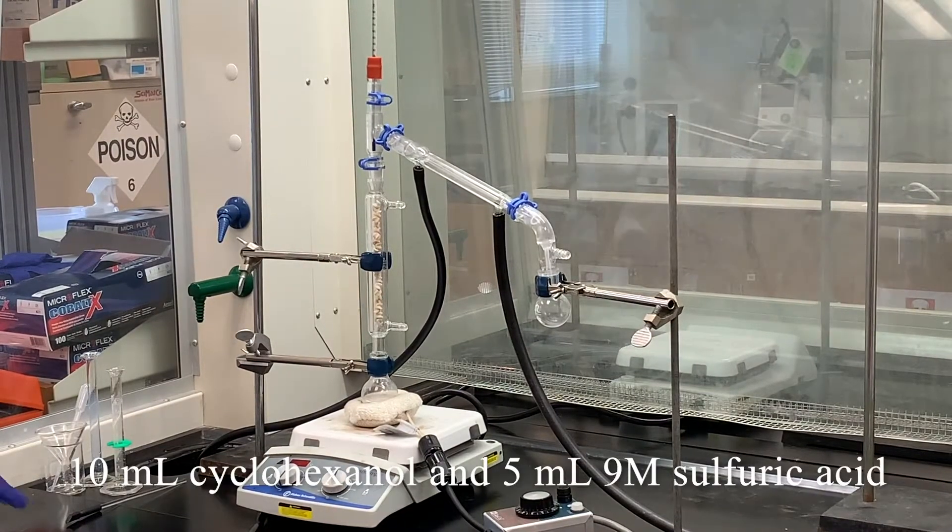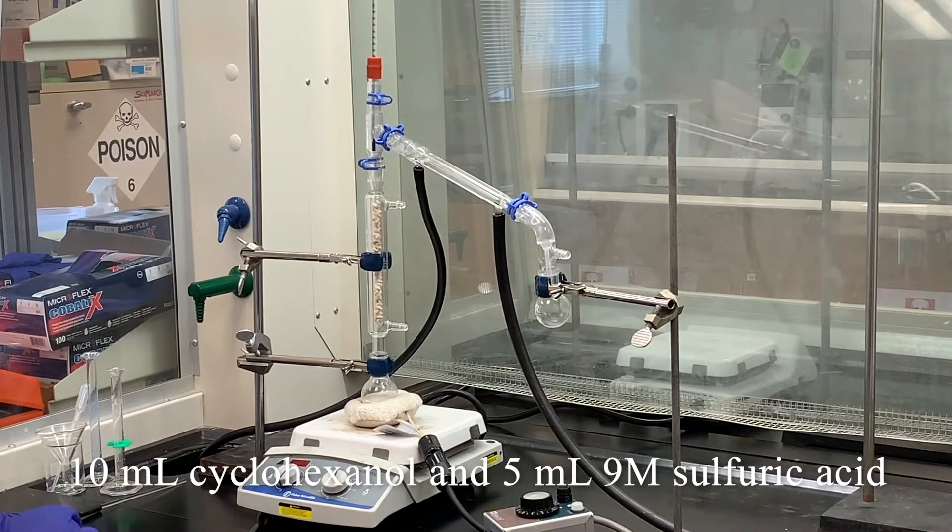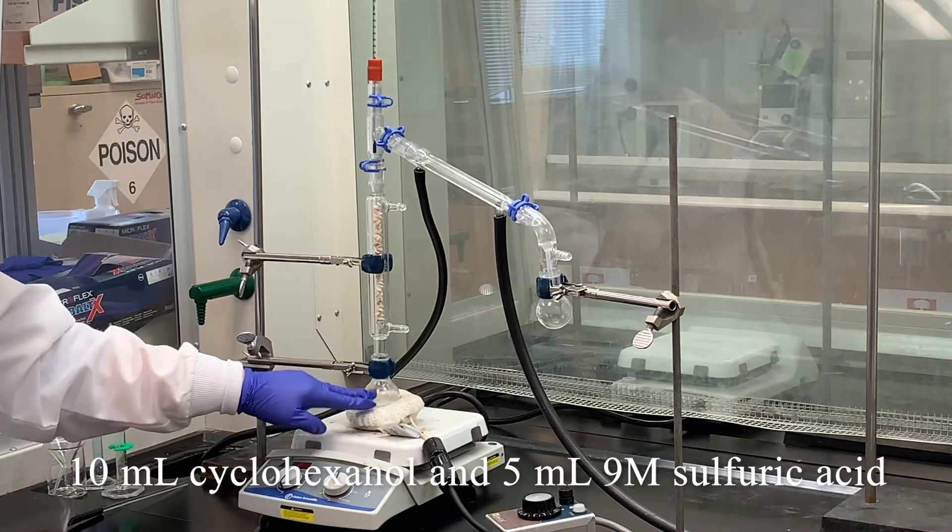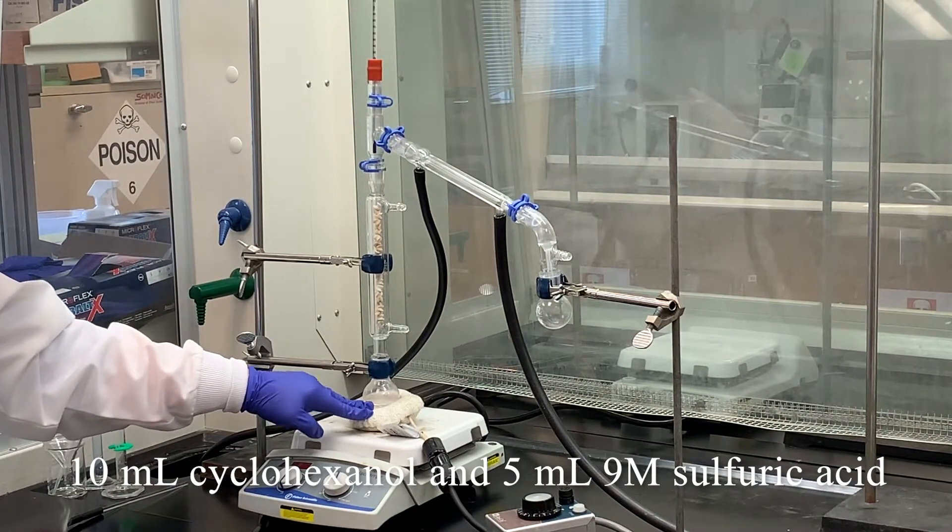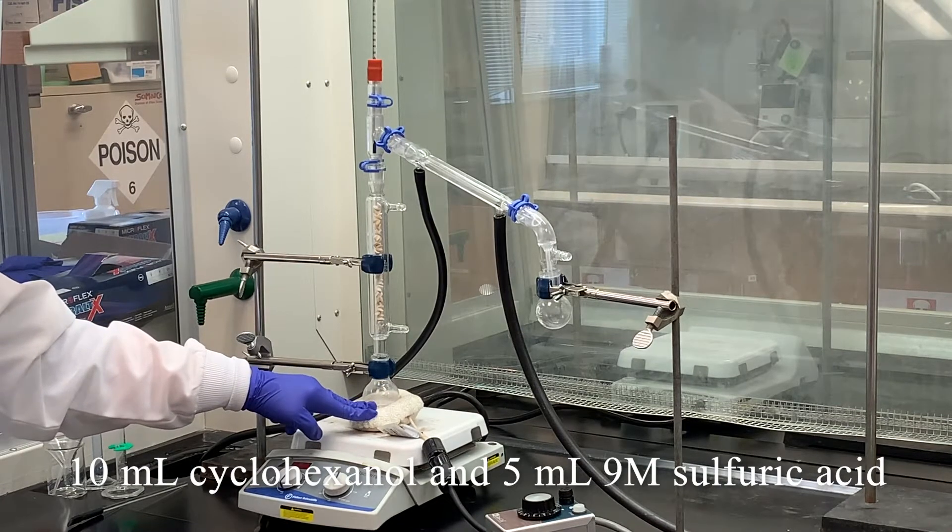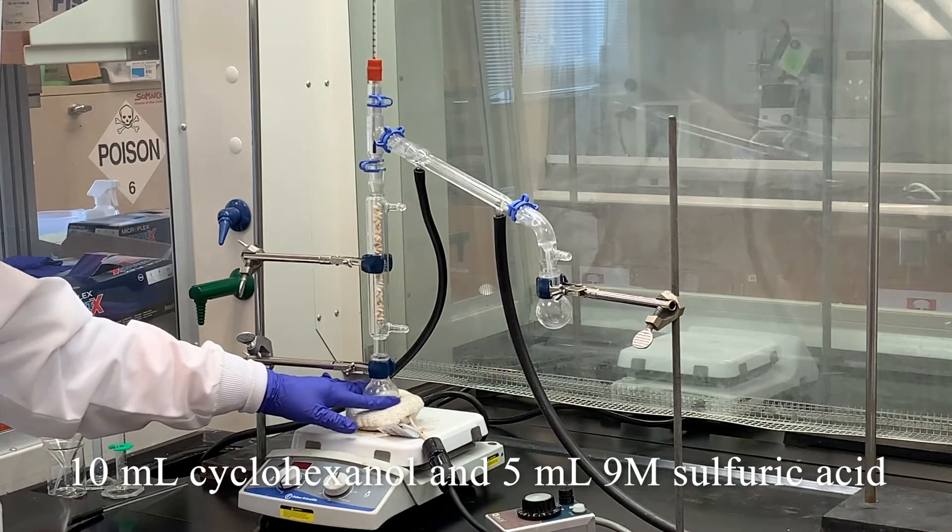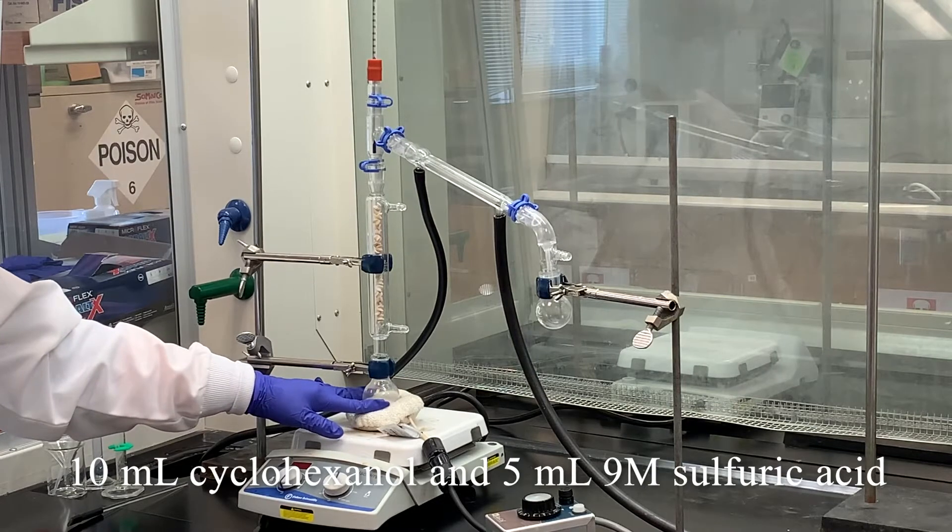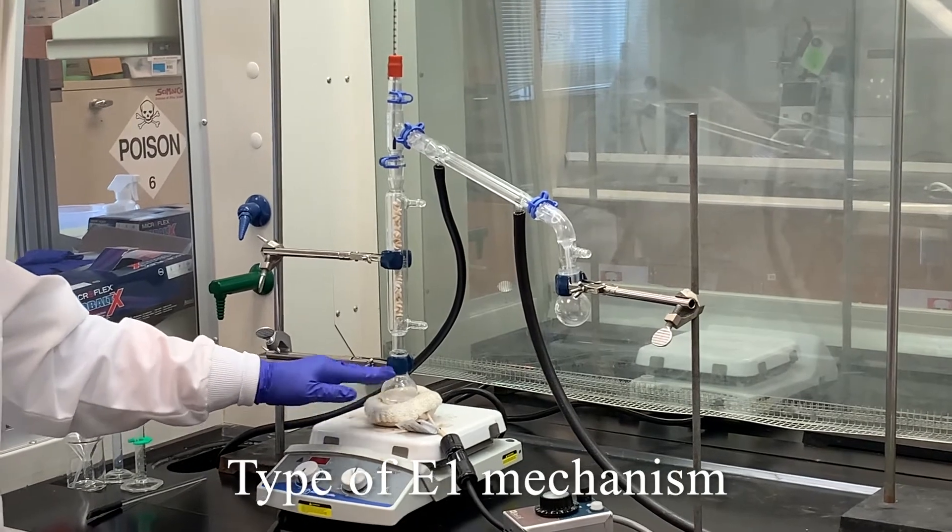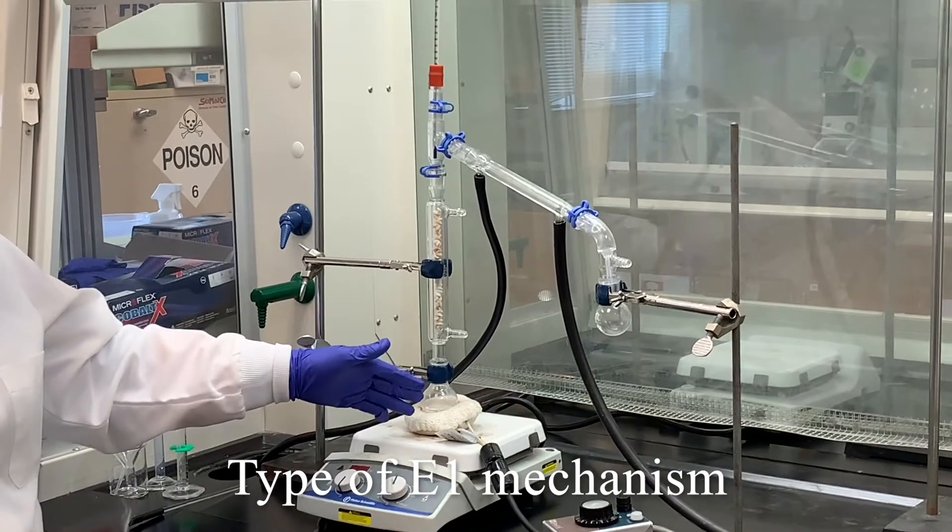And we're going to do this by having a mixture of cyclohexanol. I have 10 mLs of cyclohexanol and 5 mLs of nine molar sulfuric acid. And this is a type of E1 mechanism, and usually heat is needed to facilitate this reaction.